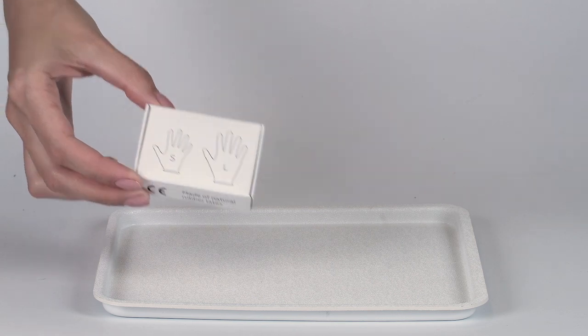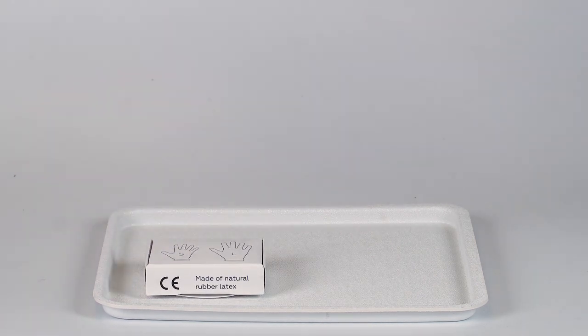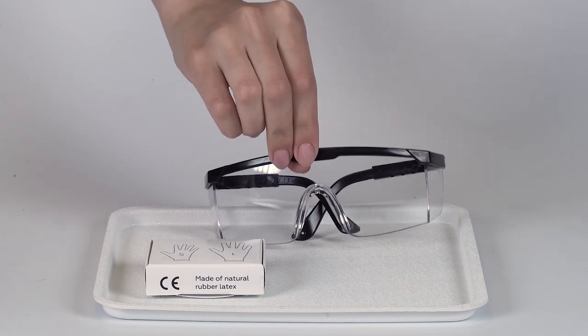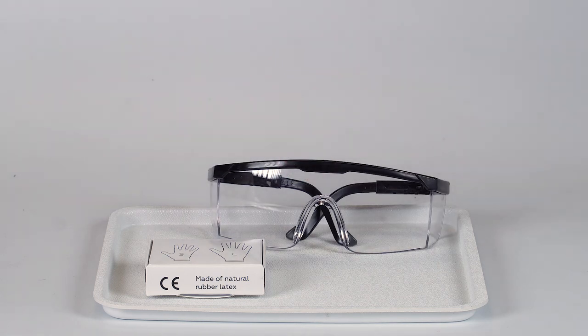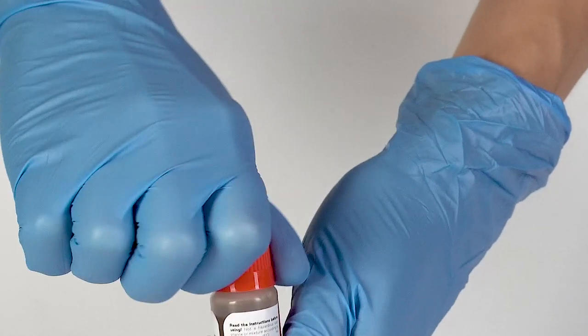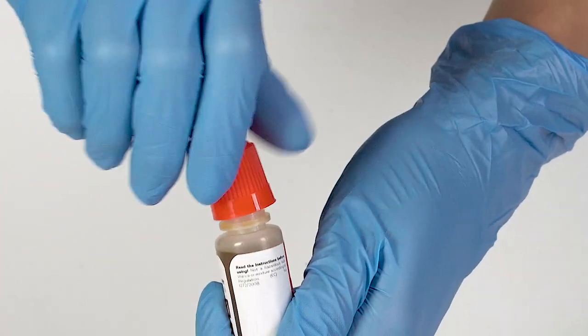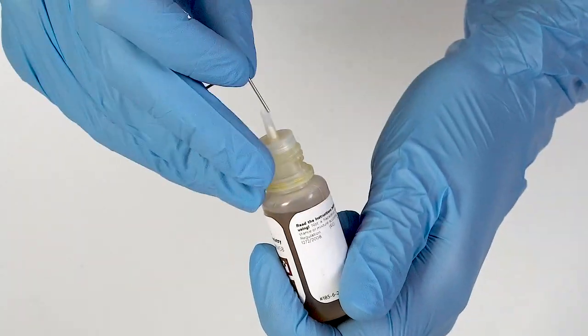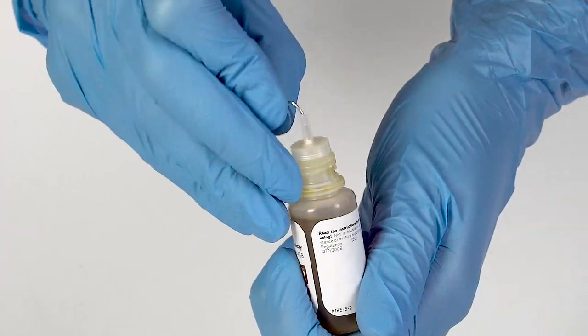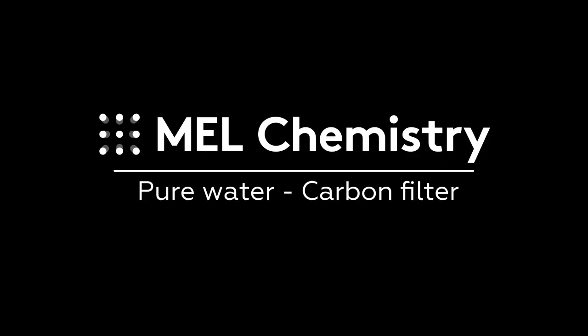Perform this experiment on the plastic tray to contain any possible spills. Don't forget to put on protective gloves and goggles before doing the experiment. To open a bottle containing a reagent, push the cap down and turn it. Pierce the bottle nozzle with an unbent paper clip.